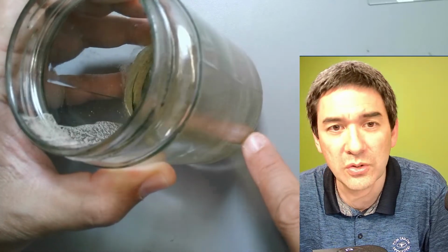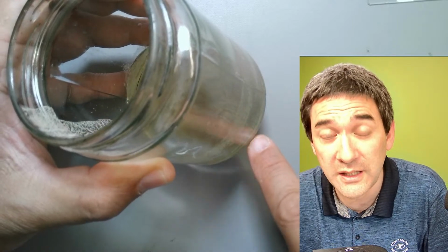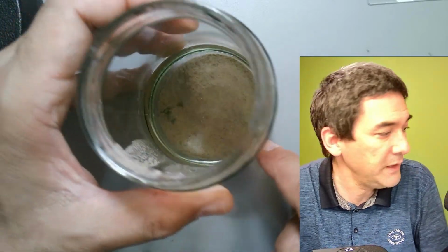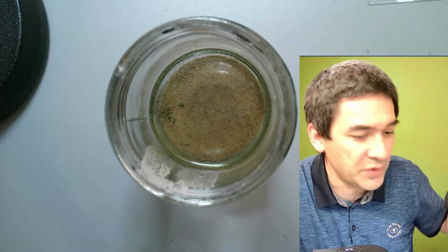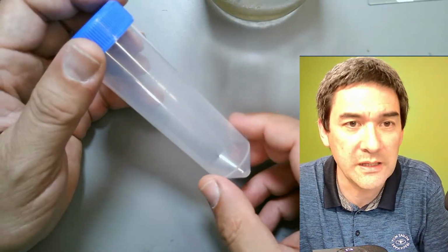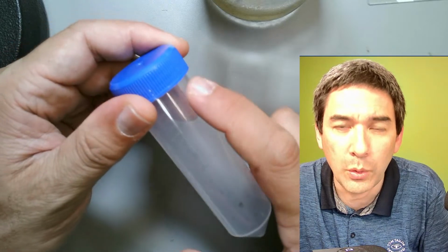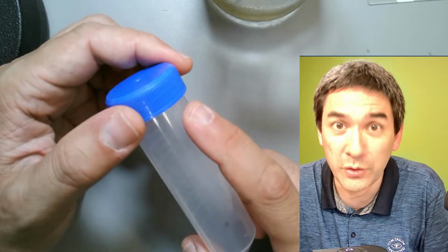I think the distance is too small here, so I think the whole thing would still be aerobic, also because there is a lot of air in here. Very briefly, if you use a tube like this to collect water samples, and I have done this as well, for example when traveling, you really have to make sure that you do not fill up the whole tube all the way to the top with water, because then it is going to become anaerobic.